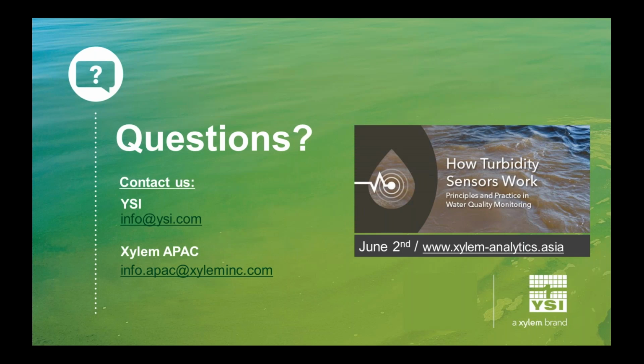So I actually recommended that they use the total algae PC sensor in that application. And I have on occasion recommended that. So now that you guys know how the sensors work and what the sensor is really detecting, you can make a more informed decision. You don't have to just rigidly say, always use the PE sensor in saltwater and always use the PC sensor in freshwater. You can make a more informed decision now that you know what the sensor is doing.